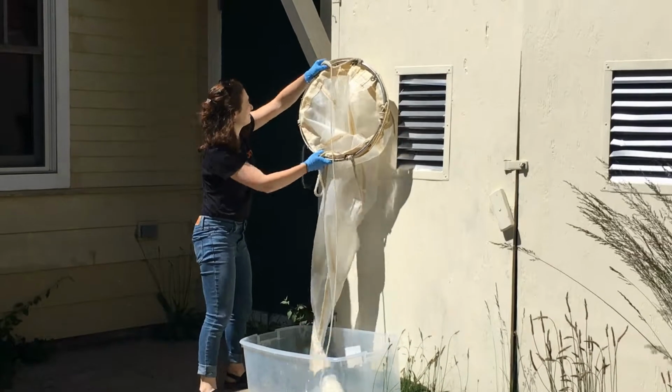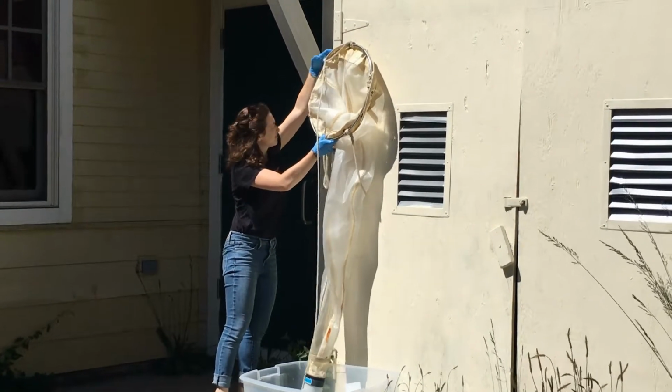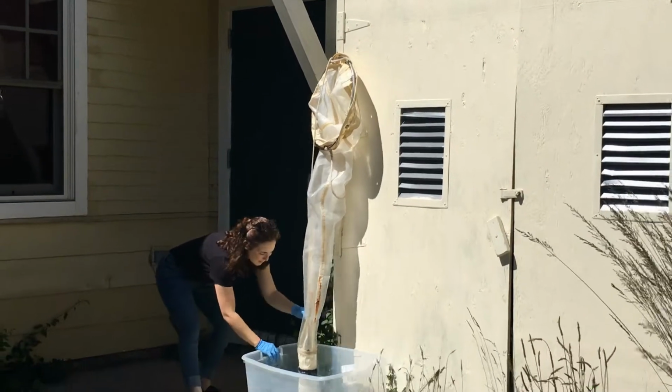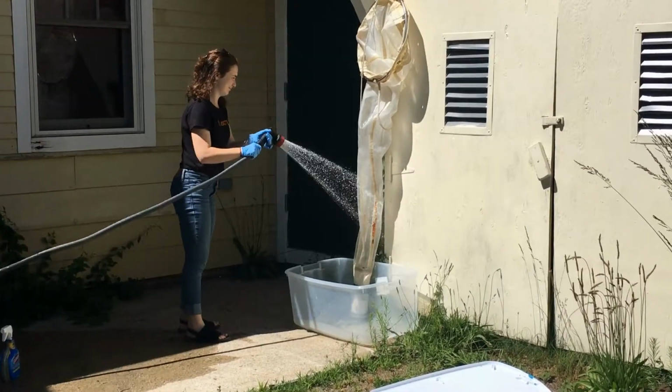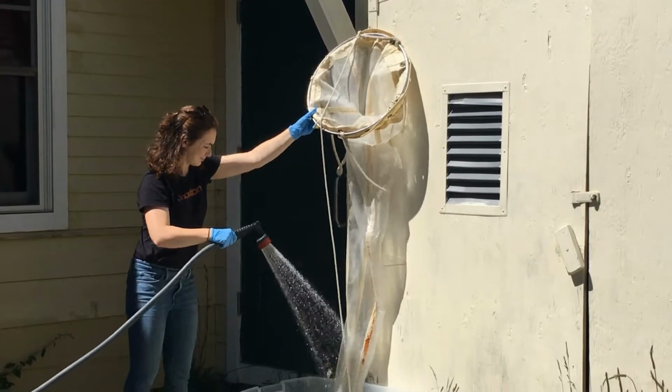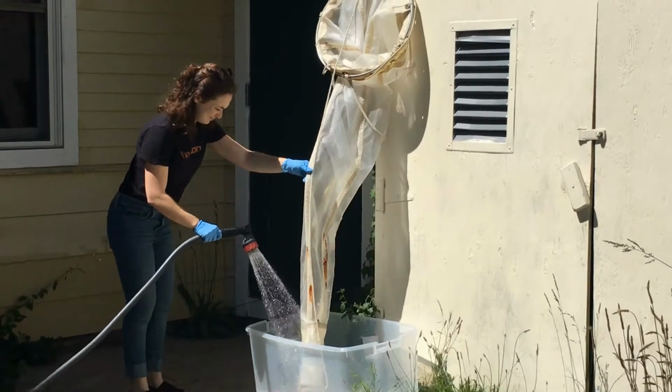Really what we're doing right now is we're trying to set up the net so that it's totally sterile, because when we get to the harbor, we want to make sure that everything we collect and everything in the water sample that we take afterwards is really from that tow and not a previous tow.